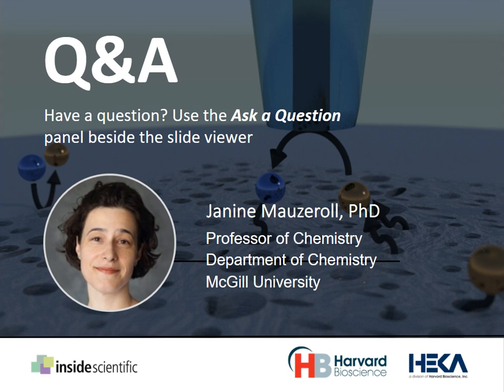So last question of the day will be, if we want to use SECM using the SGTC mode, how do we know or distinguish the current that we got is the current from SGTC instead of the current from feedback or bulk diffusion?